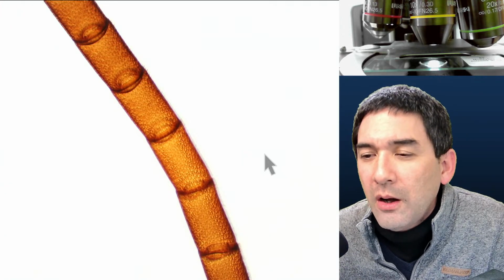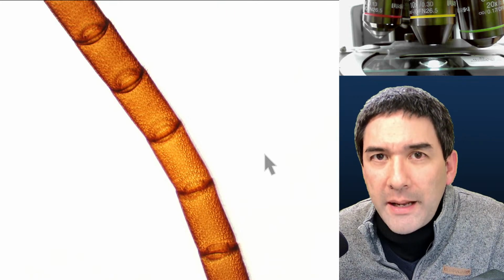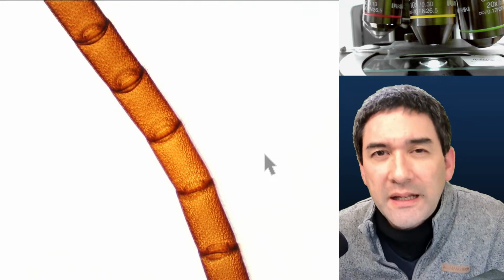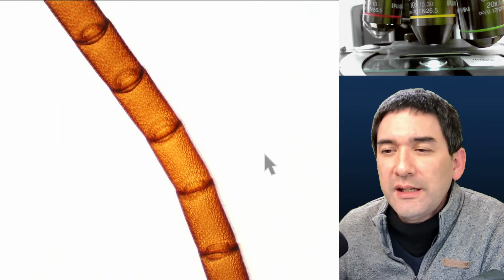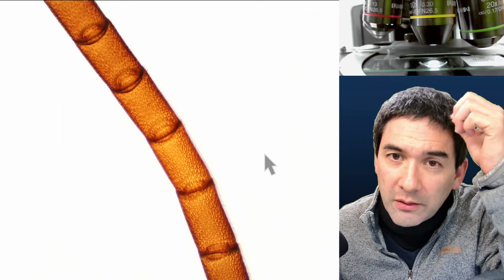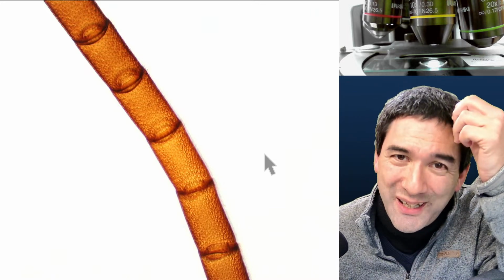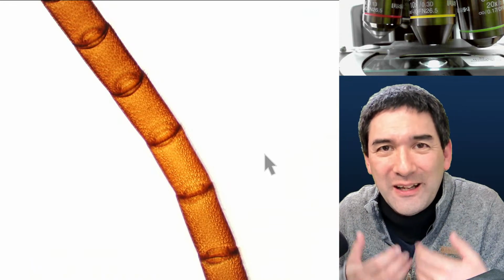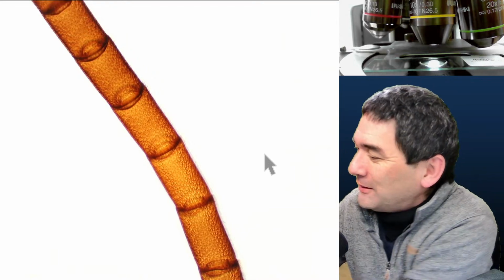Yeah. Are scales cells? Strictly speaking, they are made of protein. Cells produce them, but on their own, to my knowledge, they are not cells. Okay, so this is a little bit like hair or fingernails, which are made of proteins, but they themselves do not contain cells. They're produced inside cells, and then the protein is transported outwards. Okay, so let's move on a little bit because I do want to go through all of those slides here.